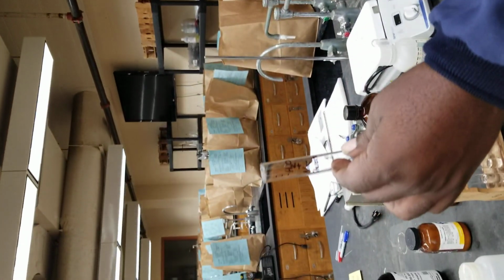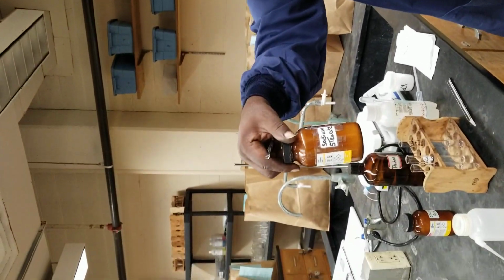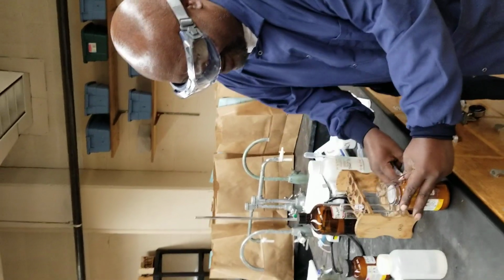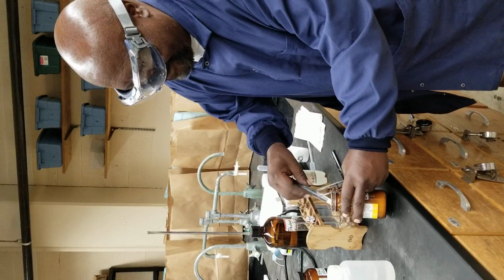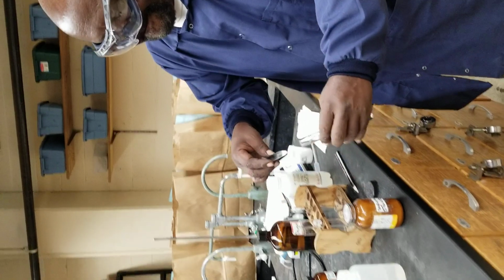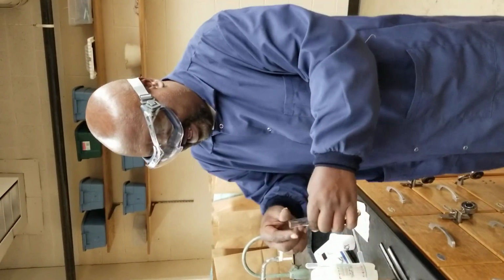Sodium stearate. Sodium stearate in water. Where is my good friend sodium stearate? There you are. Stearate. How would I know? Look up the formula. Very powdery and sticky. Put it in there.